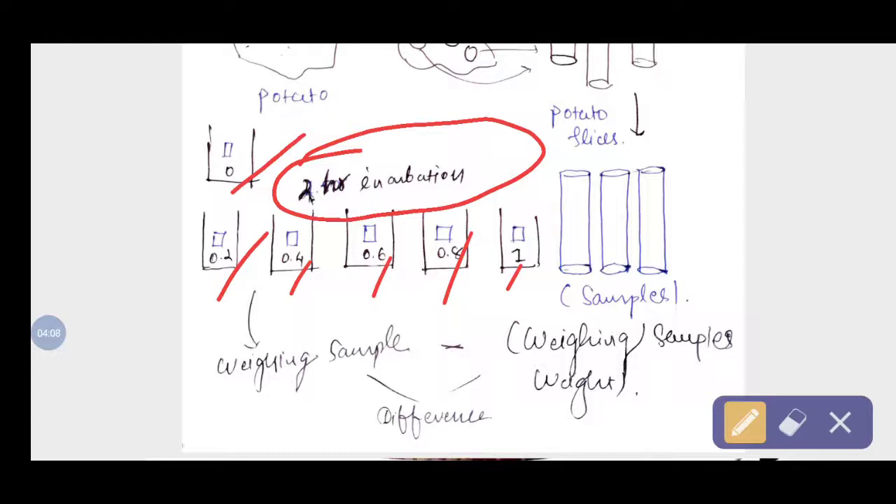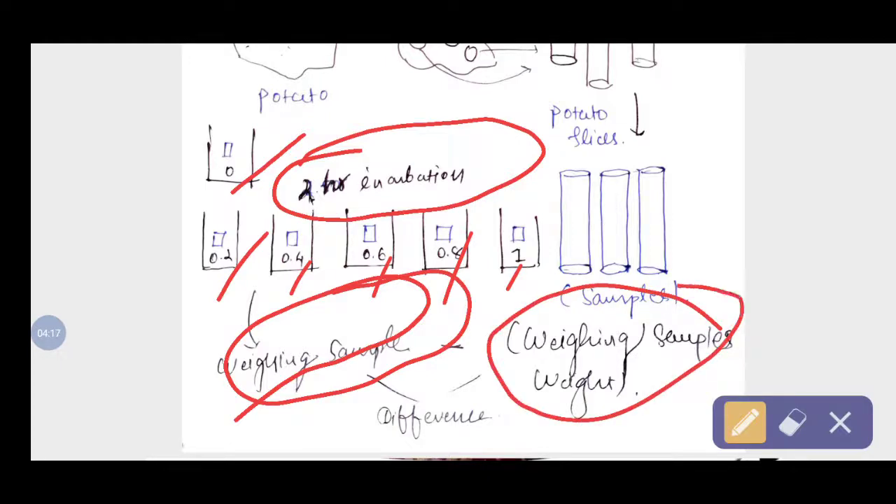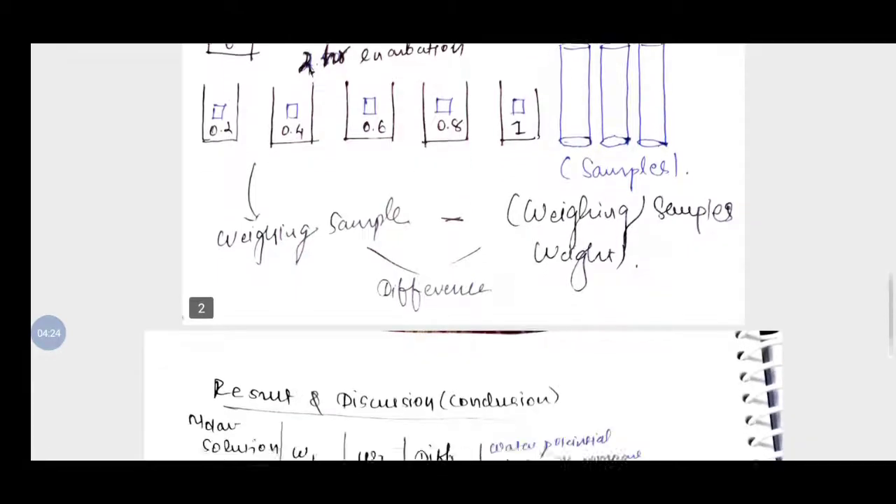After 2 hours, we remove the potato slices and place them on a paper towel to remove excess water. Then we weigh the slices on the analytical balance and note down the difference between the starting weight (W1) and the weight after incubation in the sucrose solution (W2).